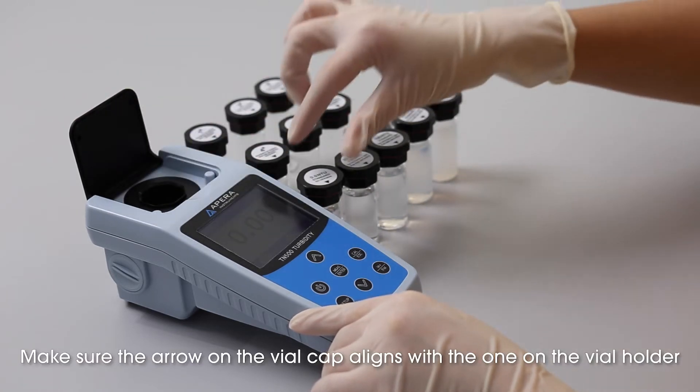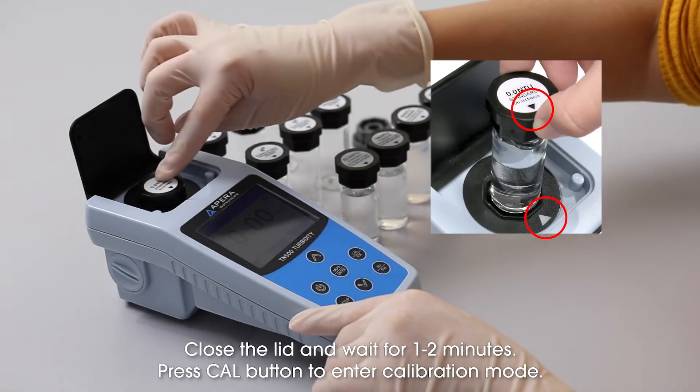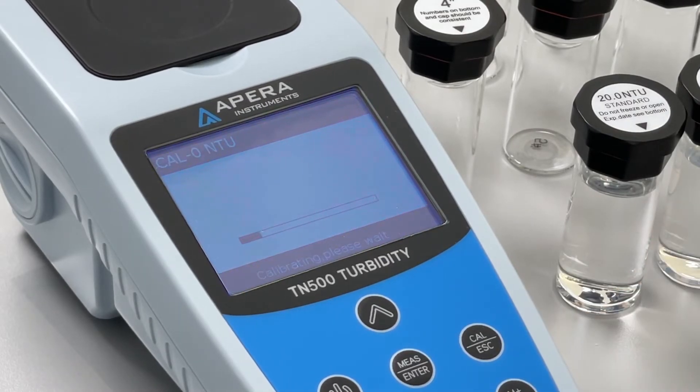Make sure the arrow on the vial cap aligns with the one on the vial holder. Close the lid and wait for 1 to 2 minutes. Press the Cal button to enter calibration mode.